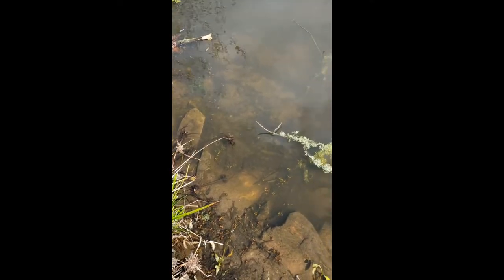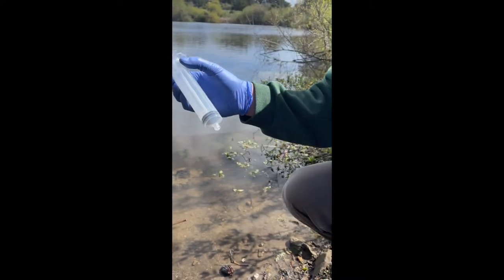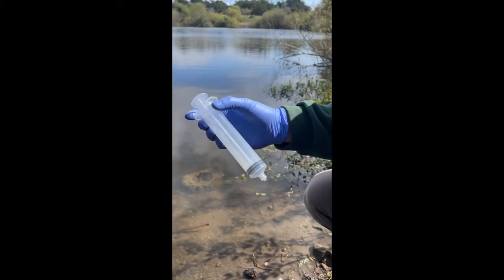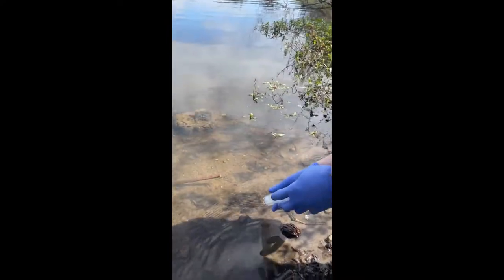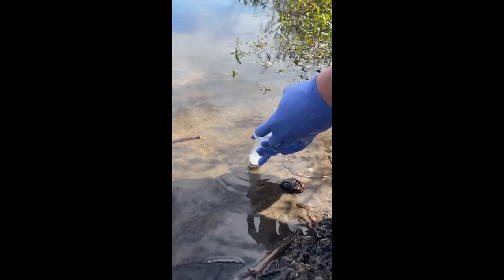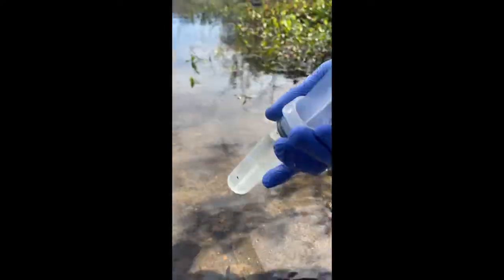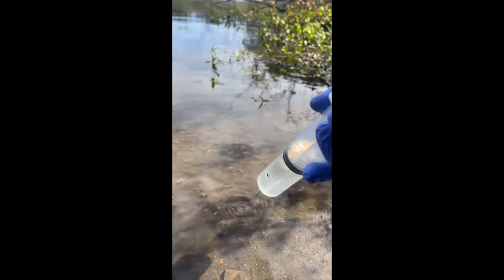Then survey for an appropriate area to sample. Begin by removing the 50 milliliter syringe from its container and drawing up a volume of water using the syringe, then dispose of that water in the area it was drawn from. We're now ready to begin sampling.